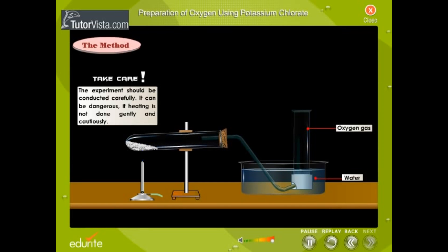The reaction that takes place is displayed on the screen. Manganese dioxide is a catalyst in the reaction.